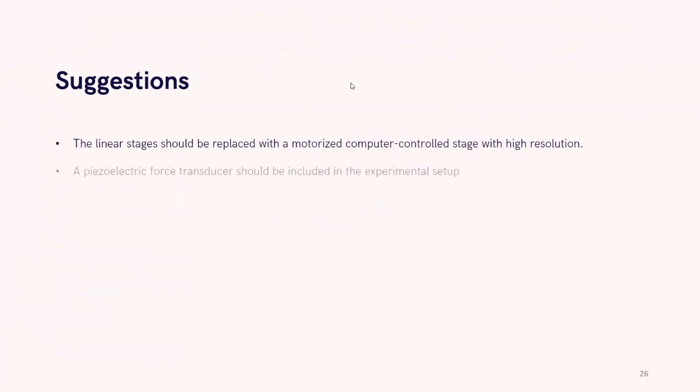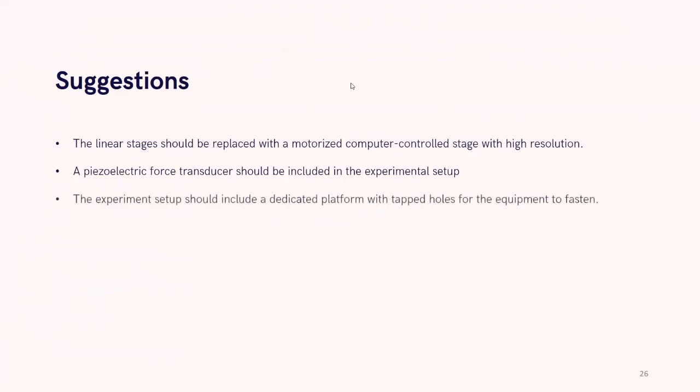As for future work, here are the suggestions from me. First, the linear stages should be replaced with a motorized computer-controlled stage. A piezoelectric force transducer should be included in the experimental setup.